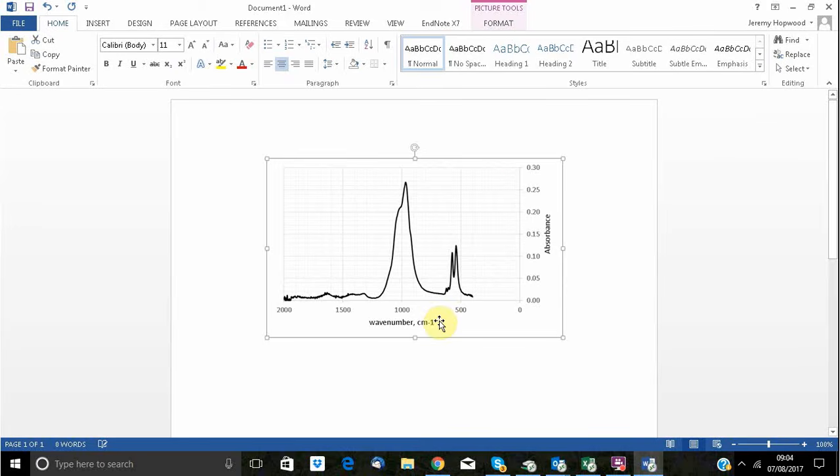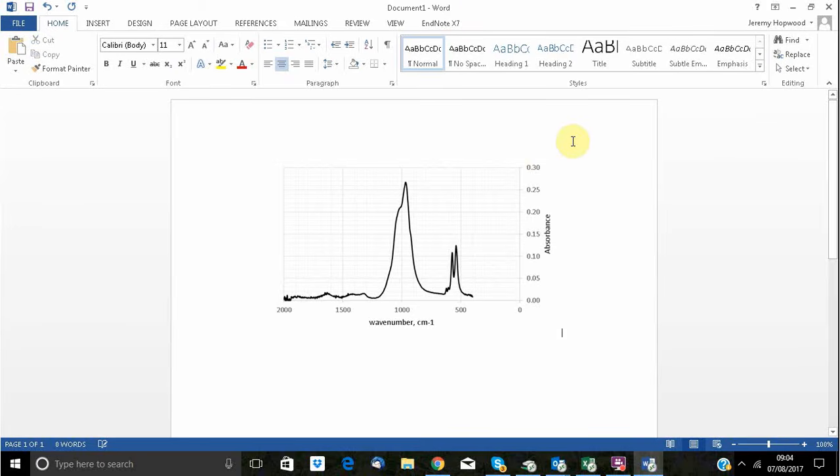This is an FTIR graph. This is how to do it. In another video, I may be able to show how to stack them, but in actual fact, stacking them is very similar to when we stack them in XRD. The difference is that you need to think a little bit about offsetting, and in this particular case, if I was stacking another similar spectra, I might offset all the y-axis, the absorbance, by 0.15 so that nothing overlapped. So the next graph would be sitting just above it, but not on the 0. You'd add 0.15 to all your values, and then it would be sitting higher up.